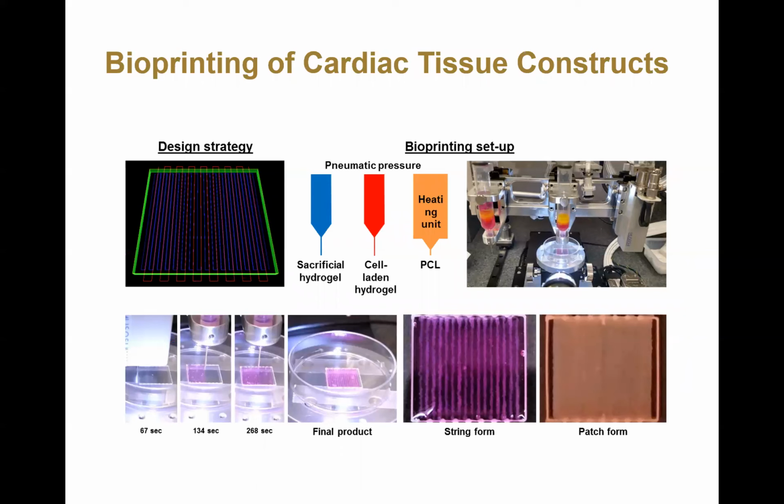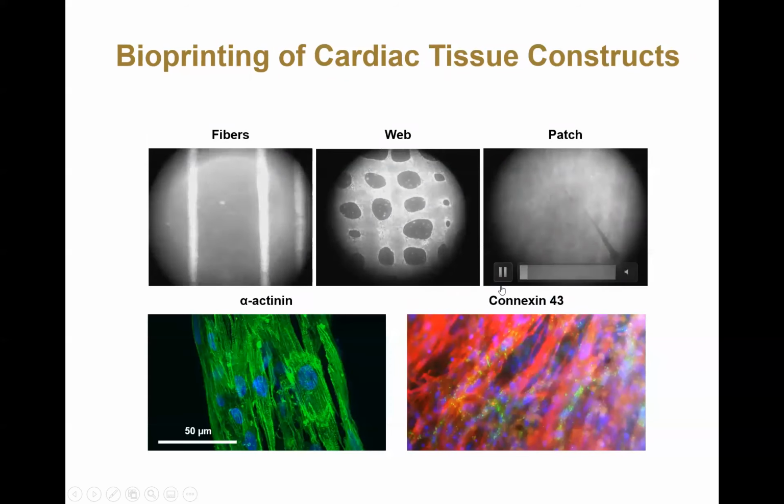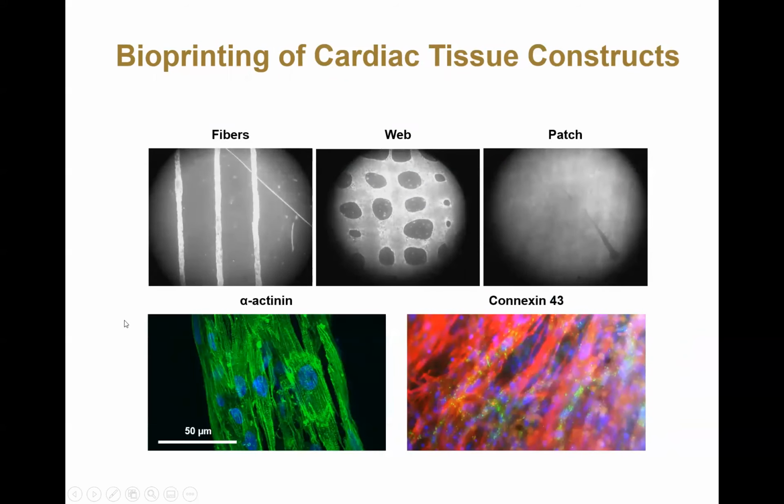You can use this to print cardiac tissue as well. And here we can print both fibers, a web type construct, or a patch, and they all beat and function after printing.